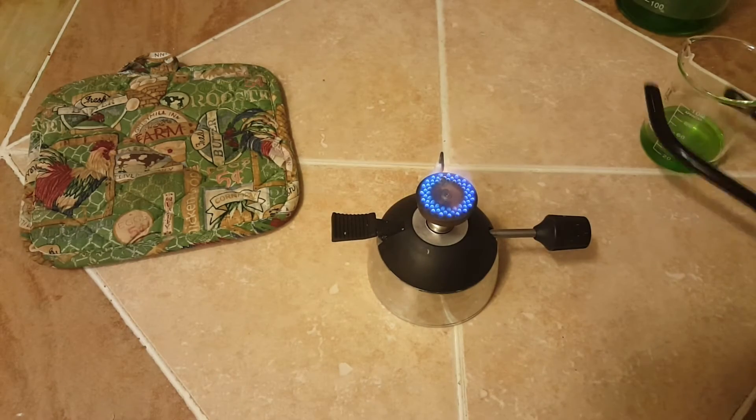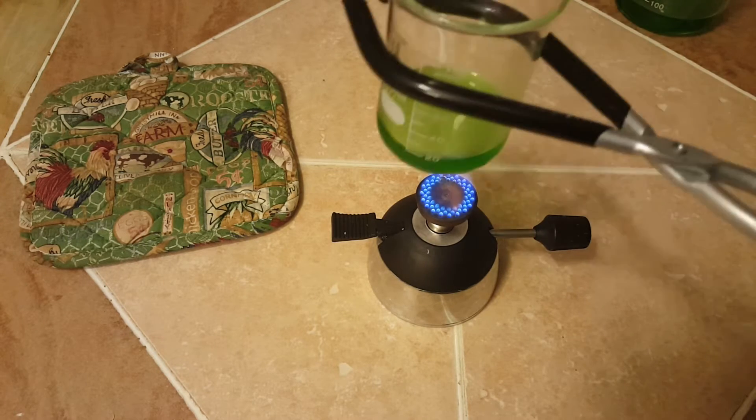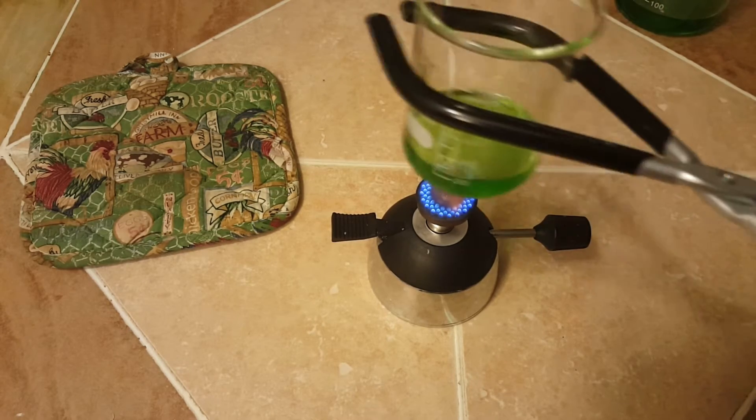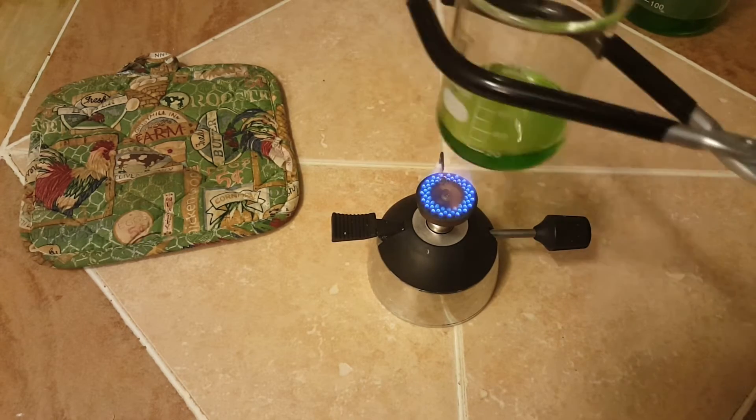For the next step we are going to heat our solution. Remember that you're working with a sulfite solution, meaning it's going to be putting off a lot of gas — really bad smelling stuff. So again, work in a very open, well-ventilated area.